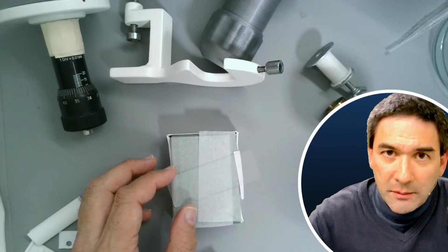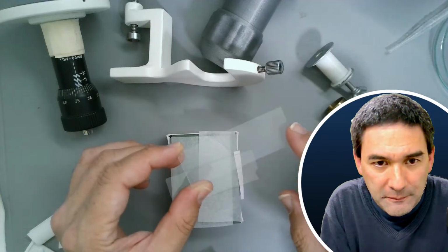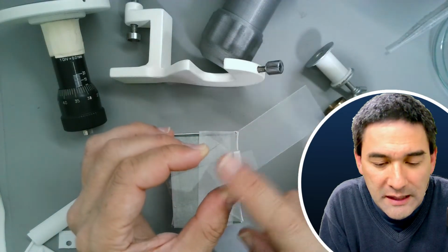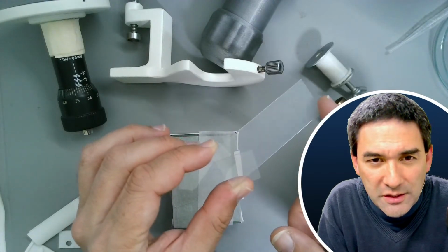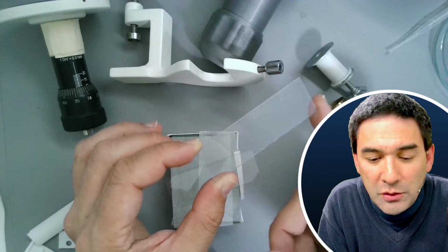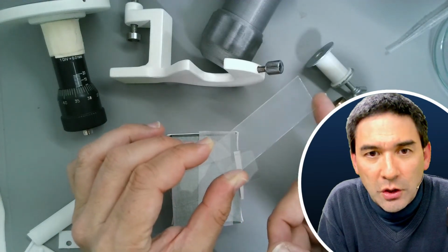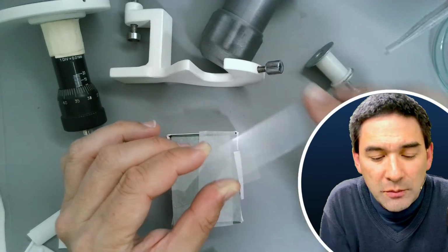But there's a reason sometimes why slides are cheap, but they are a disaster. I don't know if you're able to see that, but there's this completely white layer. It's kind of like water spots. I think it's calcium carbonate or something on here. It's completely useless. So if you have slides like this, you've got to wash them in vinegar, because the vinegar will remove the calcium carbonate.